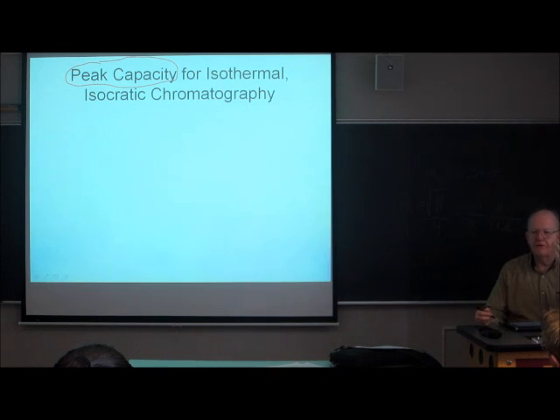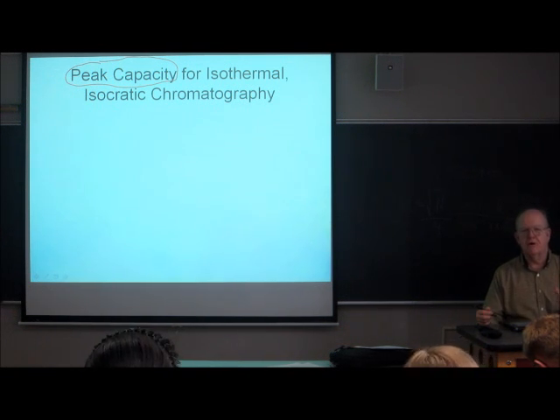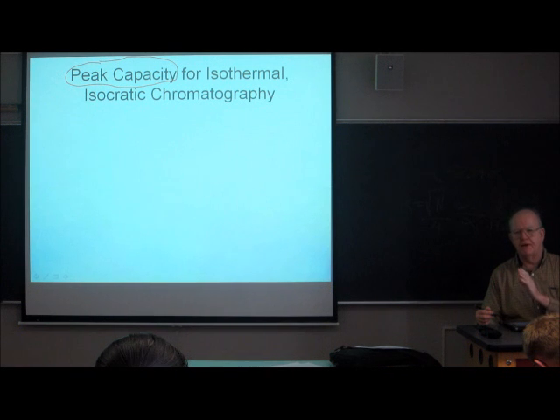The peak capacity is defined as the maximum number of peaks that you can fit between time 1 and time 2, or between volume 1 and volume 2 in the chromatogram. And it's the maximum number of equally well separated peaks.